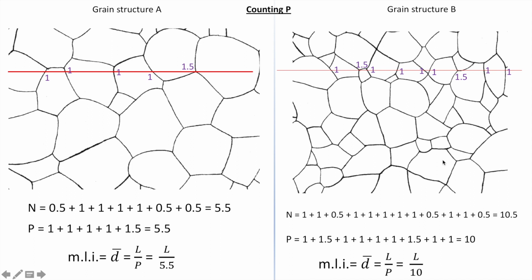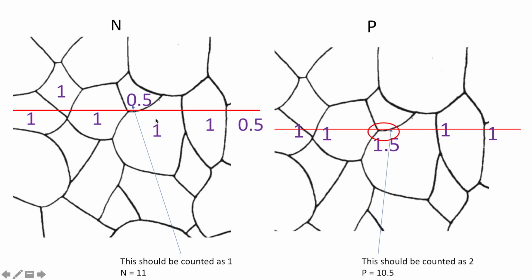I think I've narrowed it down to this point here, which causes us a bit of confusion. Let's have a look at this particular point here in more detail. Now, if we zoom the micrograph in, what we'll see here is actually that this line may not quite be a triple point. Well, in the case of N, we may not be at a tangent.